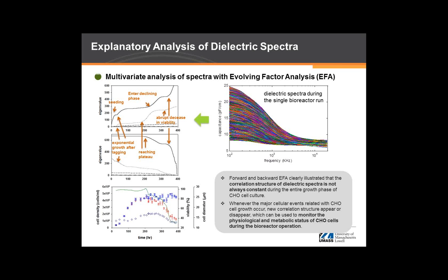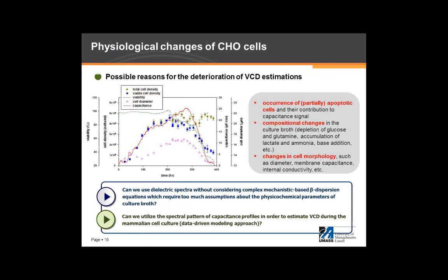So all those cell growth cycles can be captured quite well by this factor analysis, which is based on the full spectrum of the dielectric spectroscopy. This indirectly indicates that we need to look at the whole spectrum instead of the dielectric spectral value at a specific frequency. Then we looked into why this dielectric spectral value is happening, and based on that, why capacitance values are changing.